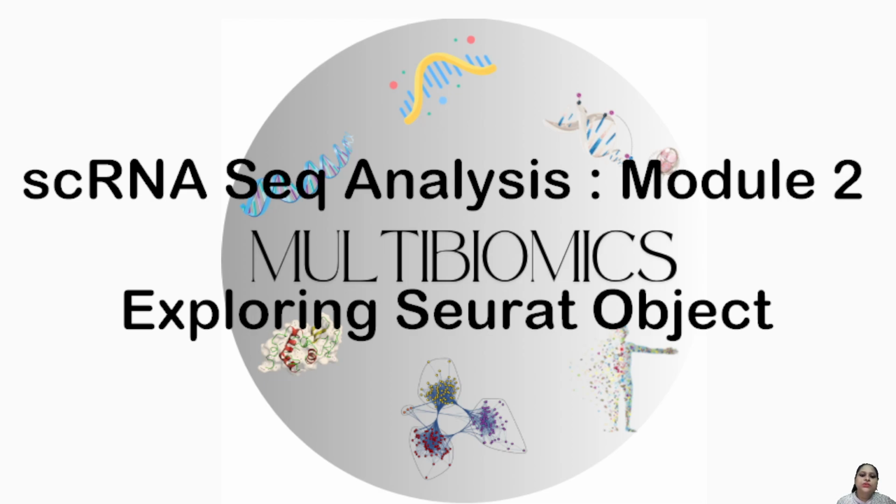I hope the videos from module 1 were in some ways helpful for you to get familiar with the computational analysis part of the single cell RNA data. Now, if you haven't gone through those videos, I would request you to please go through them once, as the few videos which are coming are a continuation of the first module.